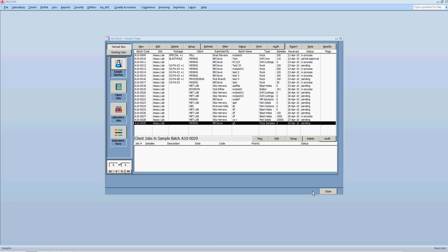I think we should plan it like logging a number of samples and then traveling. Okay, let's try to log in as one of the samples. You, because I am training you.